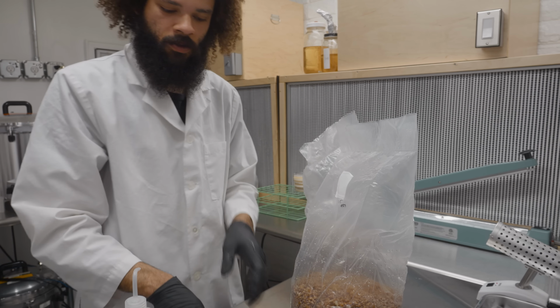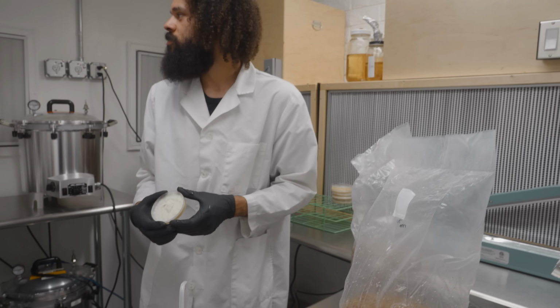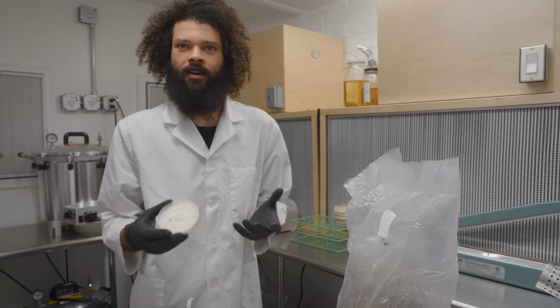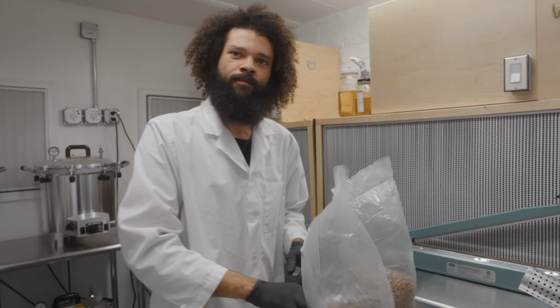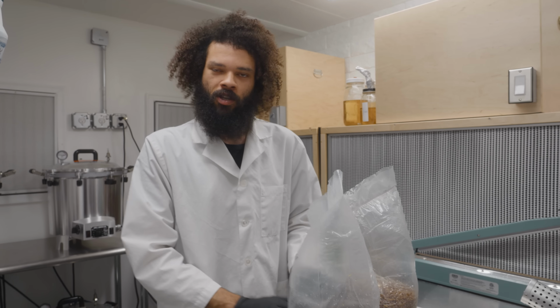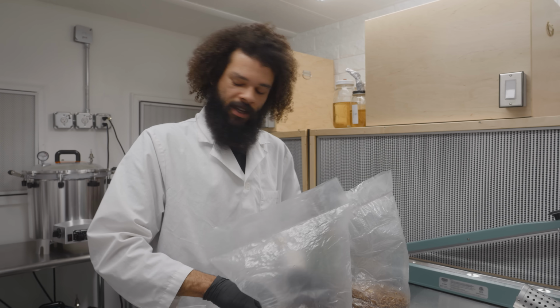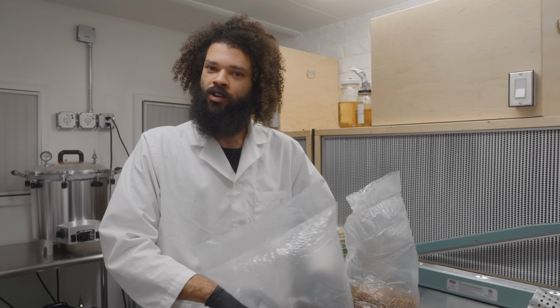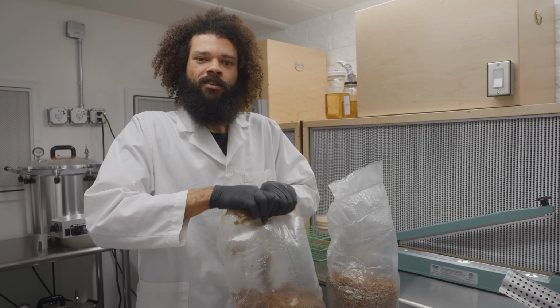I just have to replace those petri dishes, but we had a couple fall, and at this point they won't be used anymore. So they're basically contaminated. It's just not worth messing with at this point. We have more plates in the incubator, so we can just go grab them and replace them. That's why it's always good to make several plates for the same strain, just so you have them on hand, and back them up religiously.